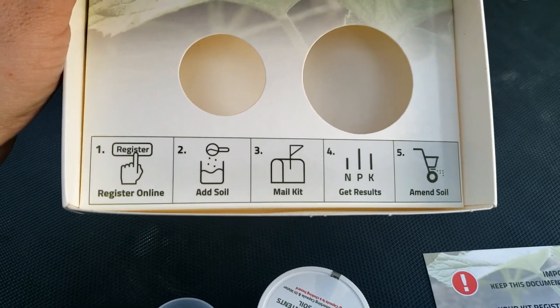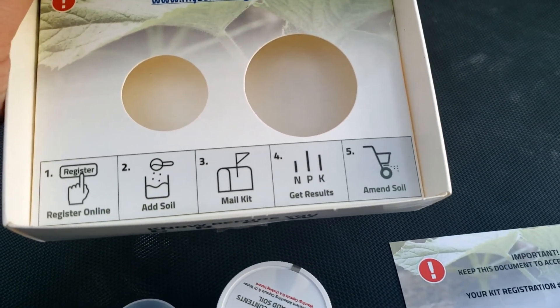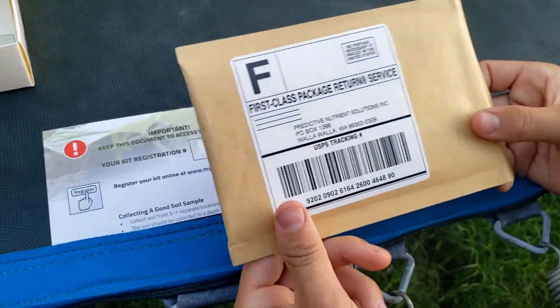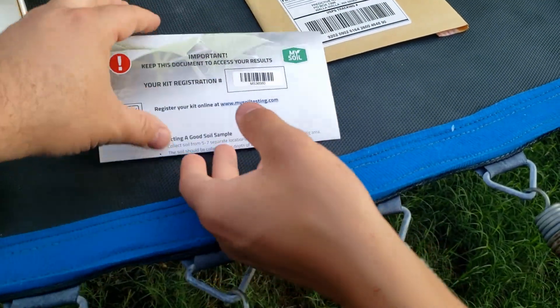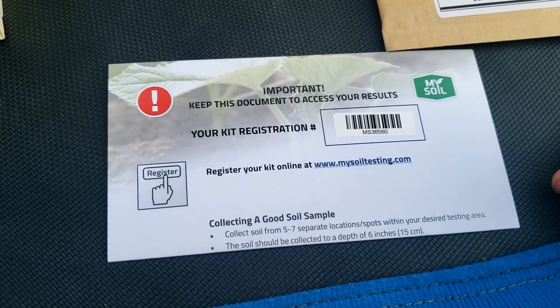It says: one, register; two, add soil; three, mail kit; four, get results; five, amend soil. So it comes with a first-class mail package. The first step says to register, so here's the registration — we're going to go fill that out.